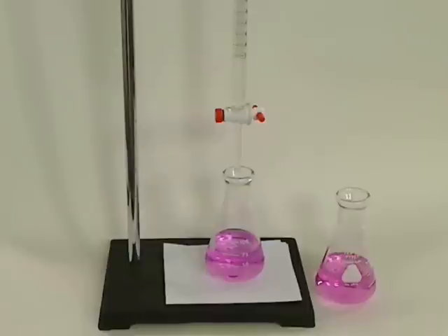The best titrations and the best titration curves you'll get come from being very patient and adding the titrant to the analyte in the Erlenmeyer flask.